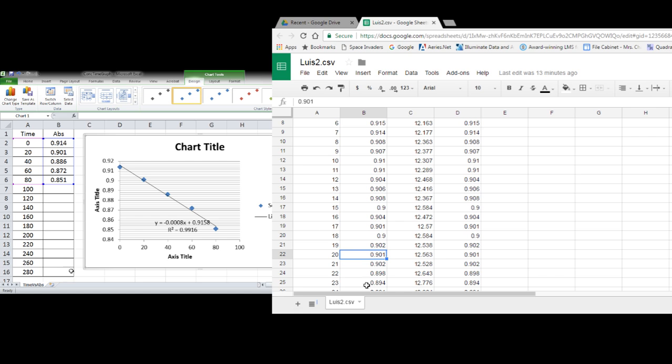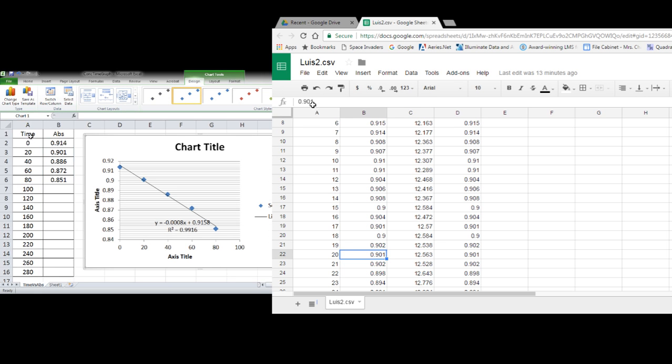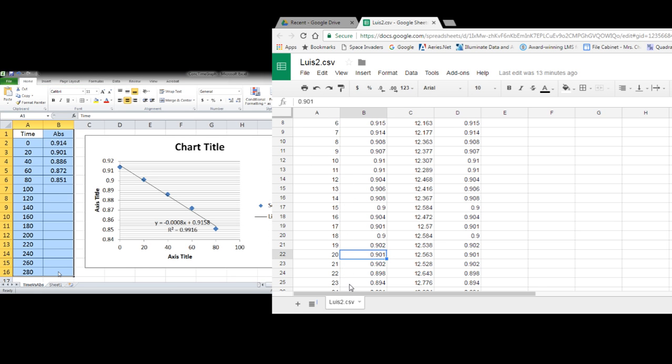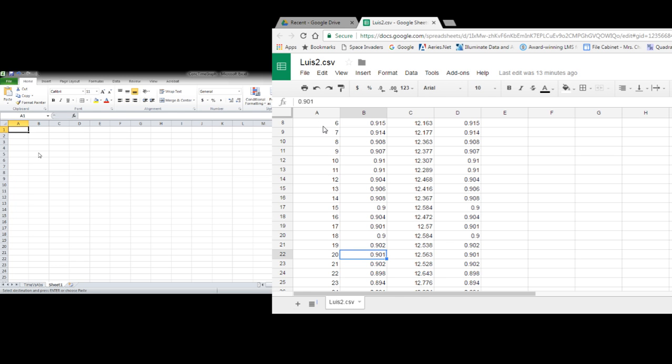And so we've got our absorbance versus time. Well that's great, but we want to get it converted into concentration versus time. So I'm going to go down to the bottom here and this is the new page tab. I'm going to open up a new sheet.